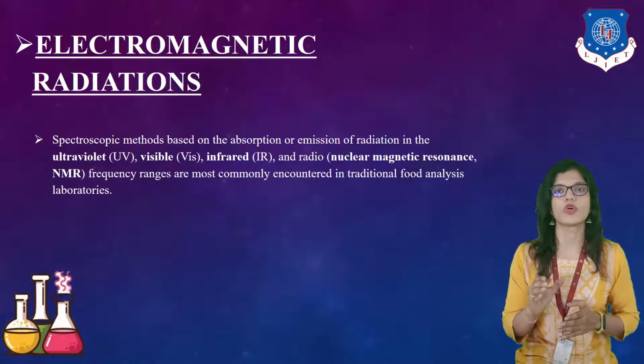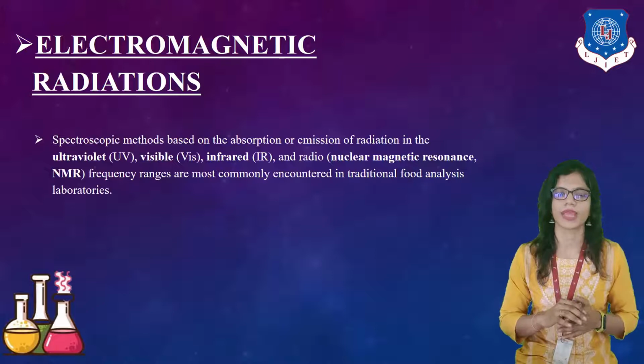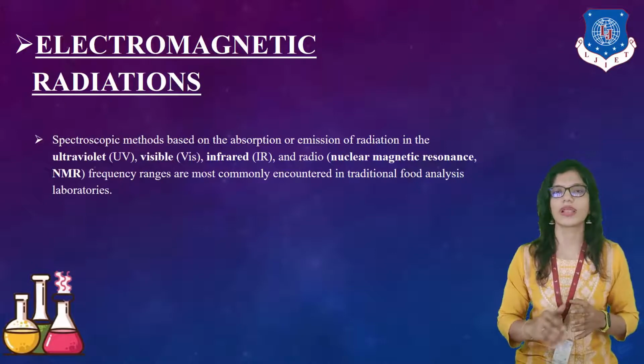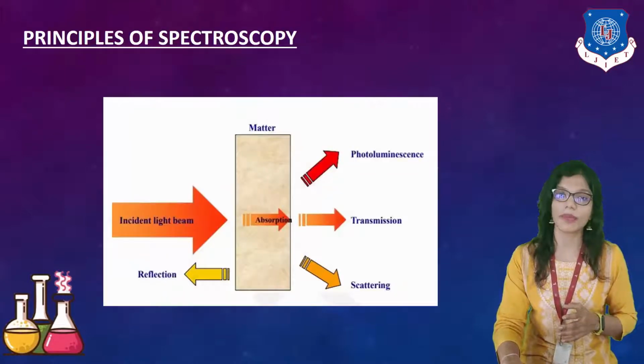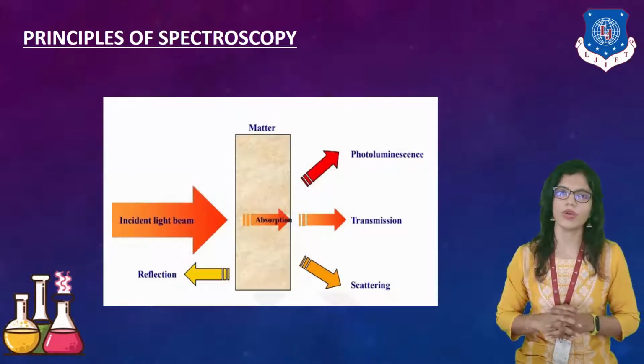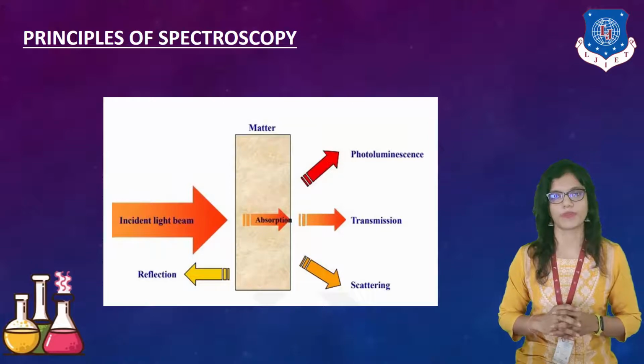NMR stands for nuclear magnetic resonance spectroscopy. These frequency ranges are actually most commonly encountered in traditional food analysis laboratories as well as chemical analysis laboratories. Now, let's move on to the principles of spectroscopy.